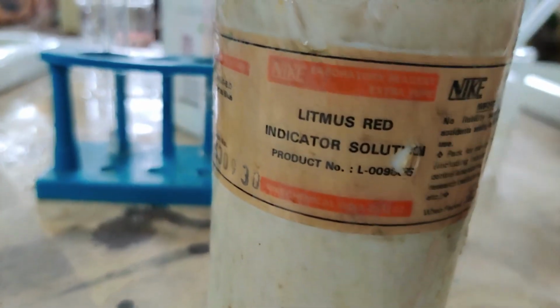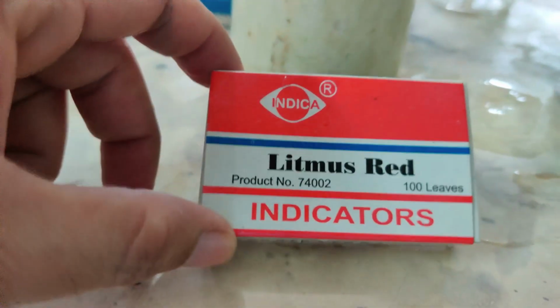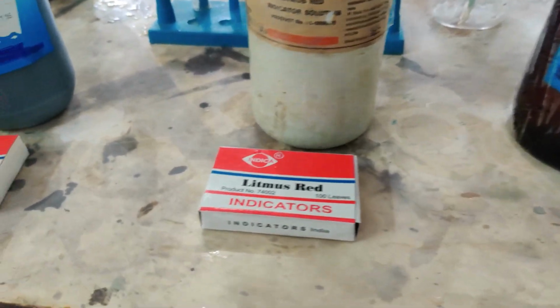Now if I keep this aside, the next one you have is here. This is red litmus. It is a solution with a red color solution inside, but then again it is also in the form of a paper. Here you have the litmus paper. This is the packet of litmus paper, so I am going to open it and show you actually how it looks.